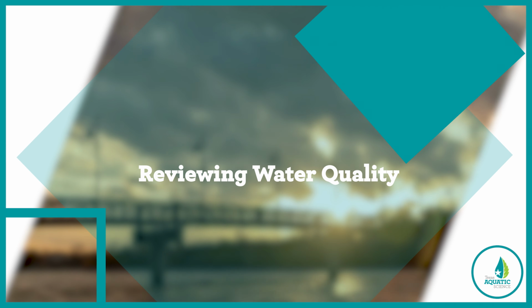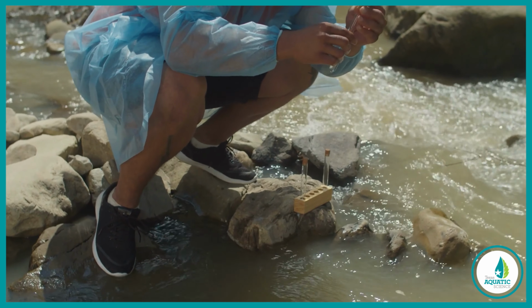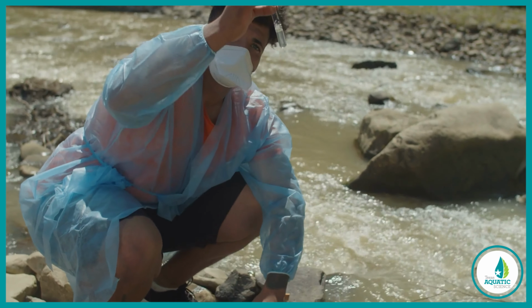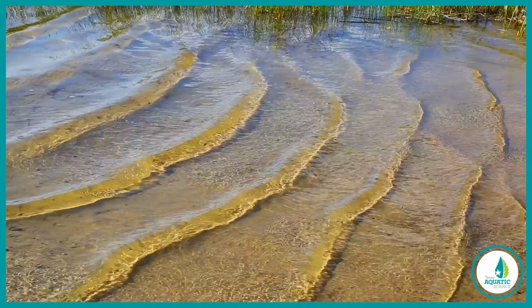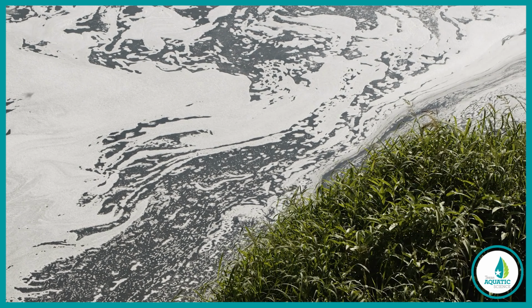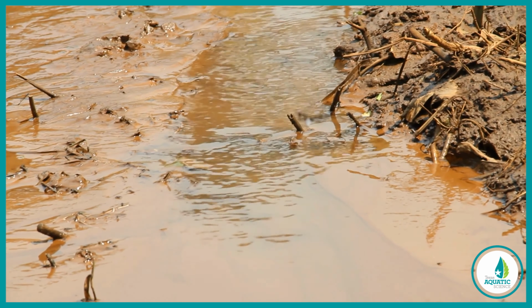Let's recap what we've learned. Water quality is essential to life, and water pollution is important to understand and monitor. Together, we've learned how to test the pH, nitrate, and phosphate levels of water samples. What do your test results tell you about the health of the Gulf water samples we tested, or samples tested from your own watershed? Did you see signs of trouble, like lots of algae, murky water from erosion, runoff from lawns, roads, parks, and animal waste?